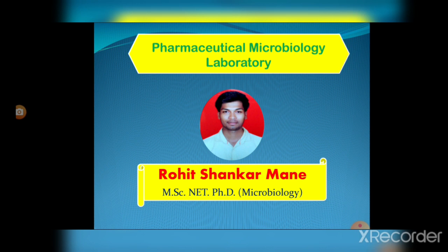Today we are going to learn about my pharmaceutical microbiology laboratory. Now in this video lecture we are going to understand what is pharmaceutical microbiology, what is microbiology, what are microbiologists and what is pharmaceutical microbiology laboratory. Now what instruments are used in the pharmaceutical microbiology laboratory, and which posts are available in the pharmaceutical microbiology laboratory, we are going to study in this video. Now let's start the video.